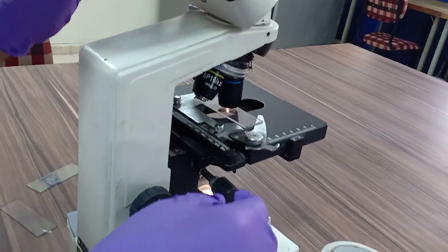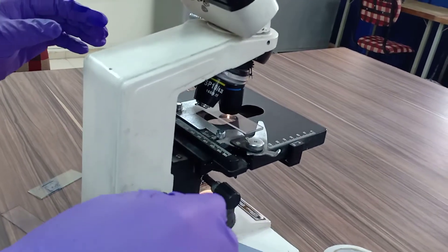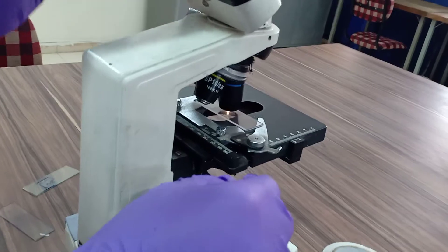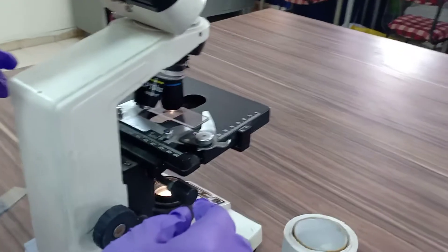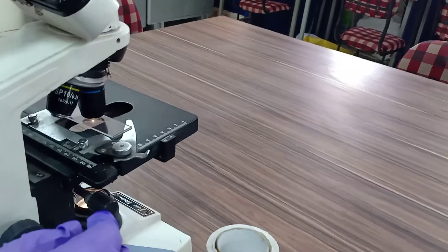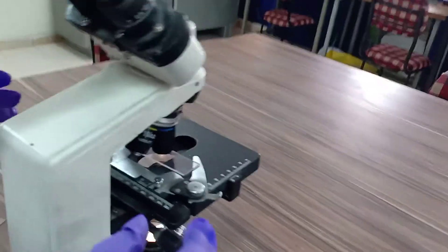You have to observe in the microscope. If the stain taken by bacteria is violet in color, it means it is gram-positive. If the stain taken by bacteria is reddish in color, then it is gram-negative.